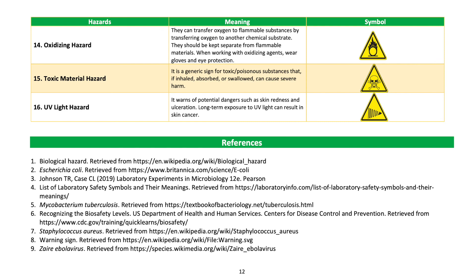Oxidizing hazard: oxidizing agents can transfer oxygen to flammable substances; they should be kept separate from flammable materials; when working with oxidizing agents, wear gloves and eye protection. Toxic material hazard: a generic sign for toxic or poisonous substances that, if inhaled, absorbed, or swallowed, can cause severe harm. UV light hazard: warns of potential dangers such as skin redness and ulceration; long-term exposure to UV light can result in skin cancer.